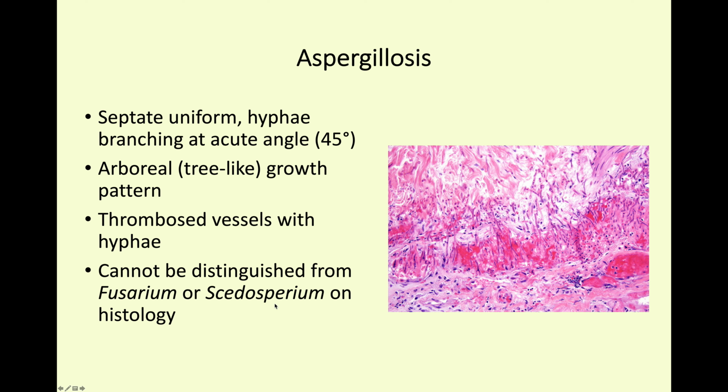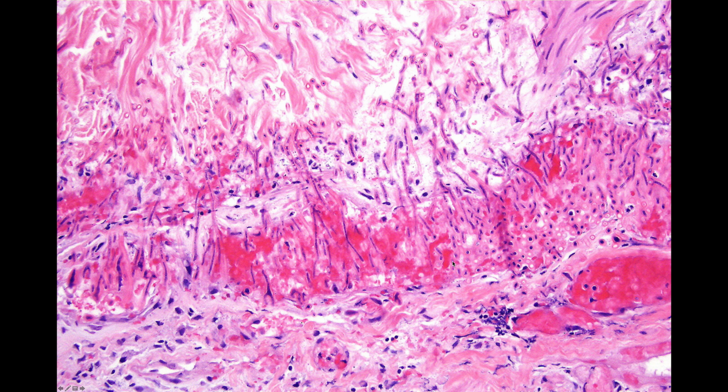Here's a close-up view of Aspergillus. It's an absolutely beautiful histology. And this growth shows you very nice septum formation in those hyphae there and there. And this shows us the branching pattern at an acute angle. There's a septum there again.